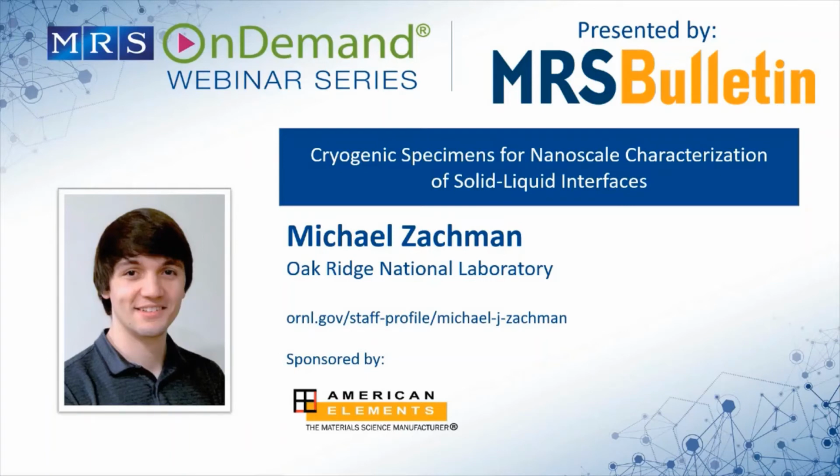So beam damage in battery materials is actually very important. It's just like in biological materials, they tend to be very sensitive, but it tends to be more of the liquid side of things that are very sensitive.